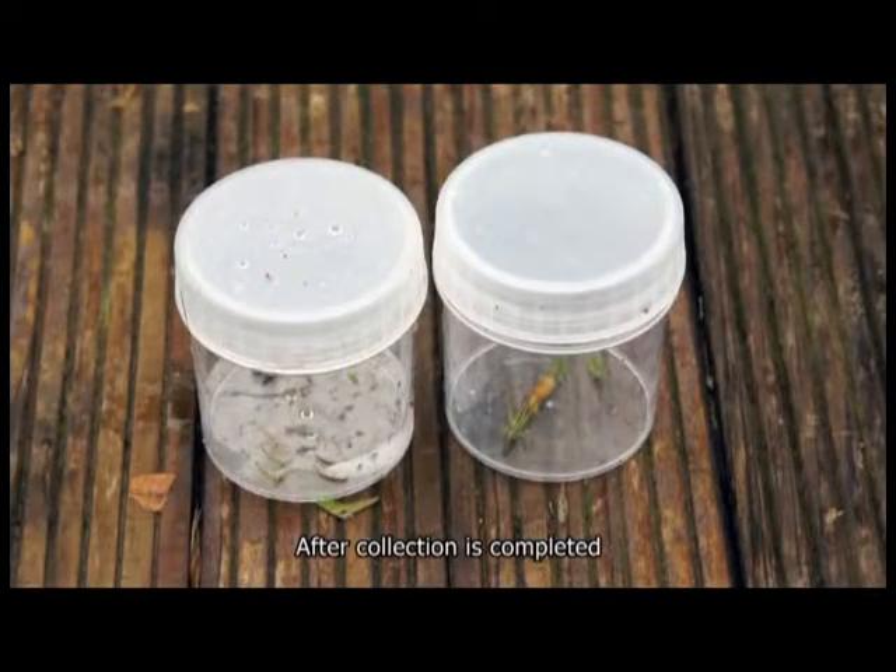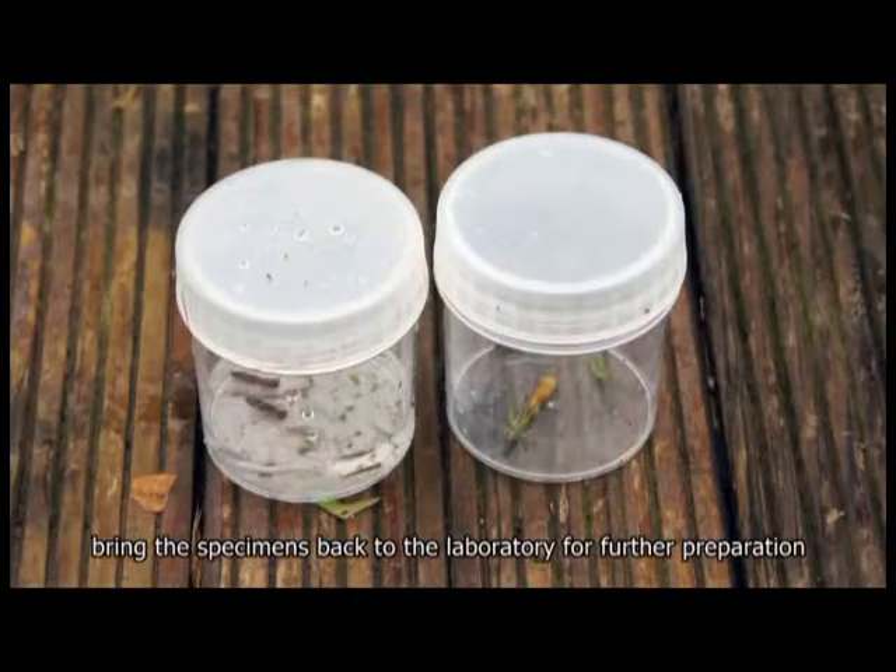After collection is completed, bring the specimens back to the laboratory for further preparation.